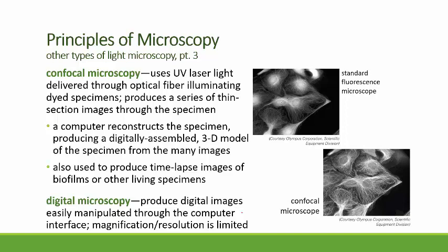It's like taking these little thin-sliced digital pictures of the specimen, and then using some fairly complex computer programs, the computer can reassemble these individual digital images into a three-dimensional model of the specimen. You can also use it to do time-lapse images of living specimens as well.